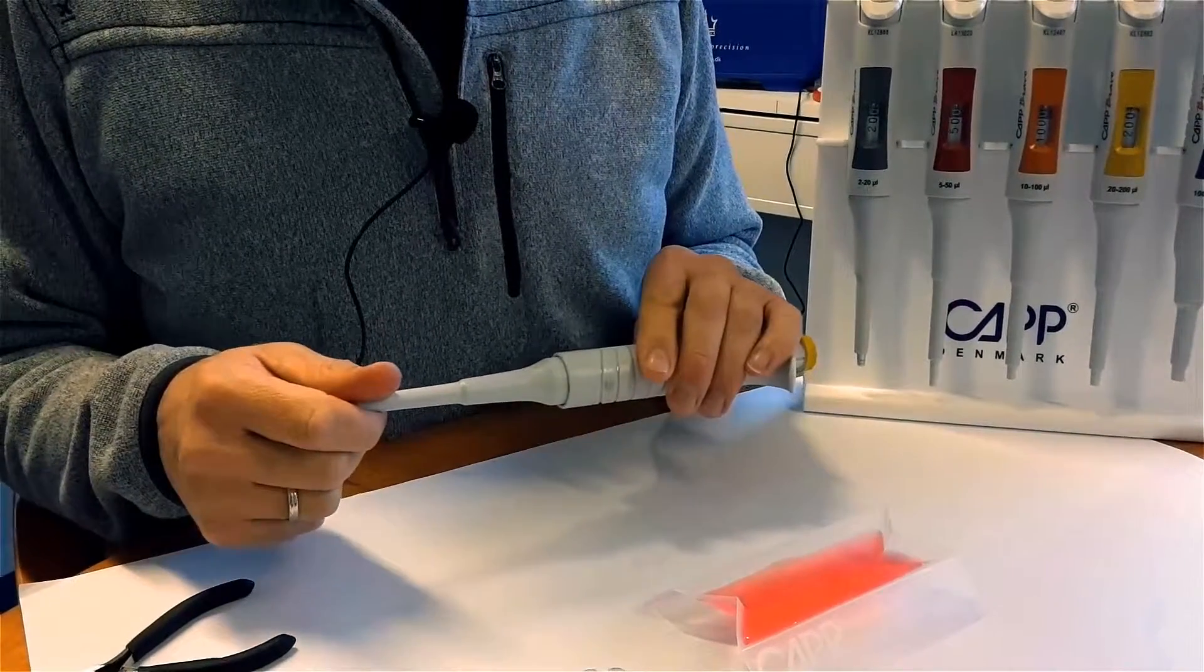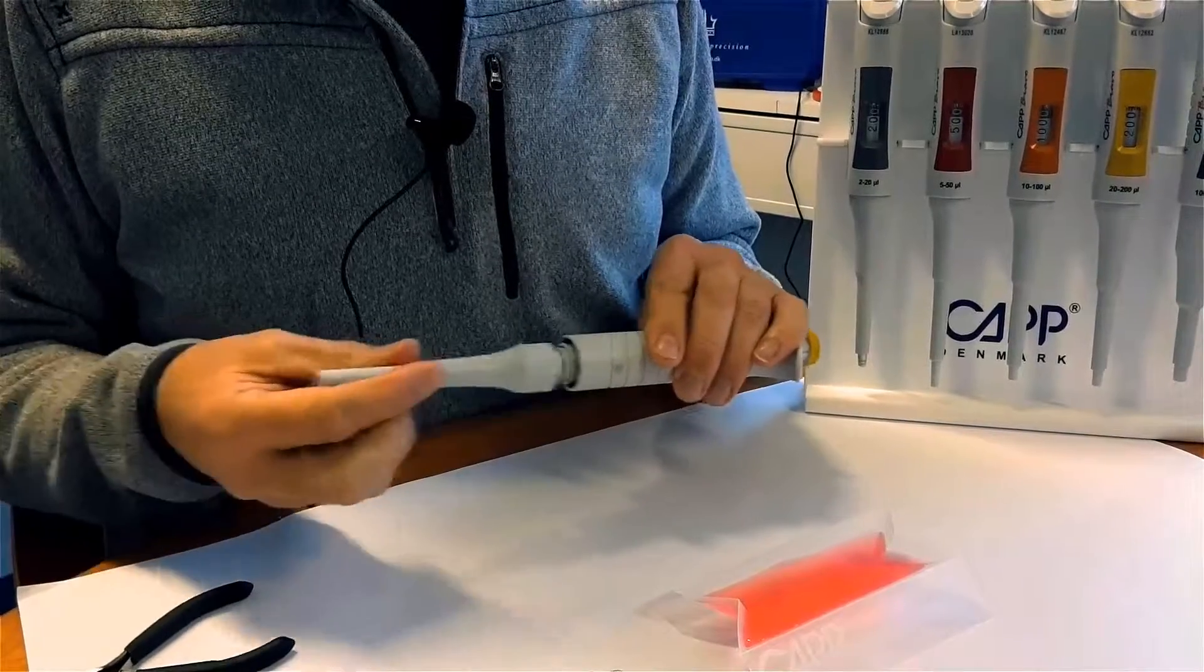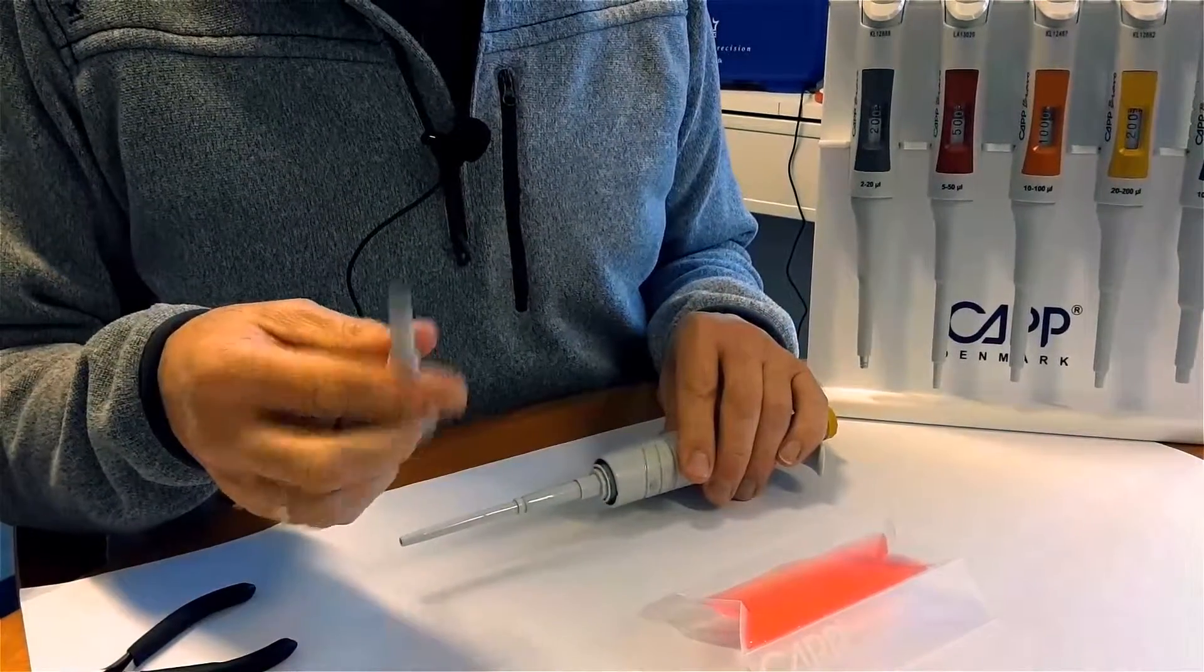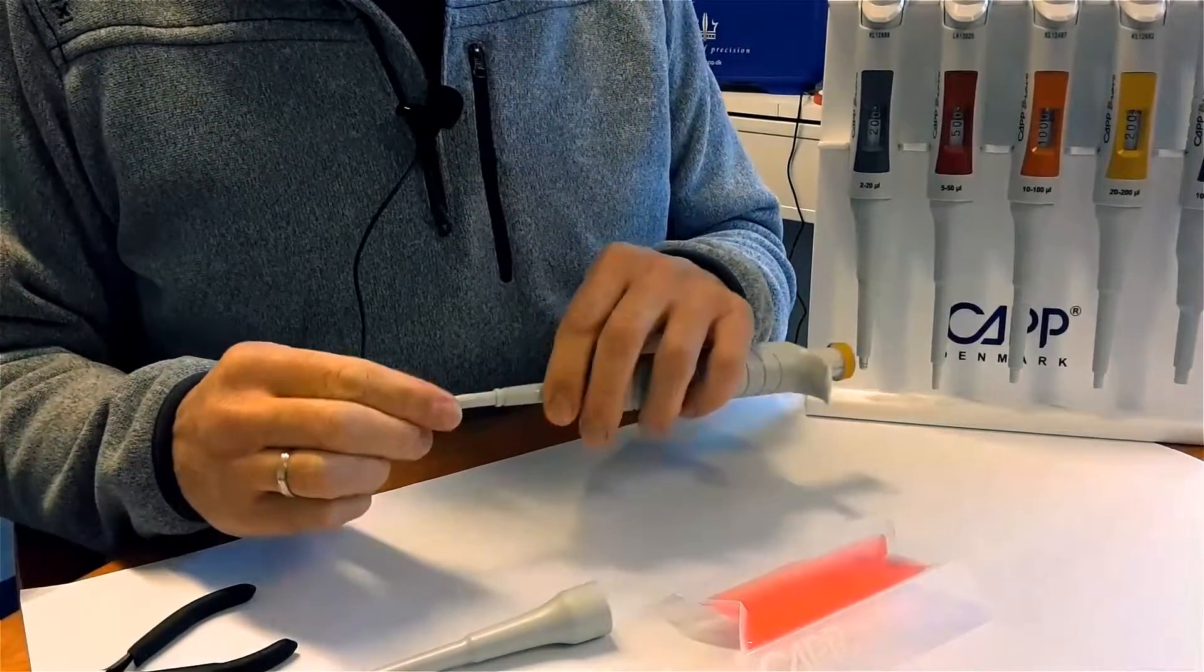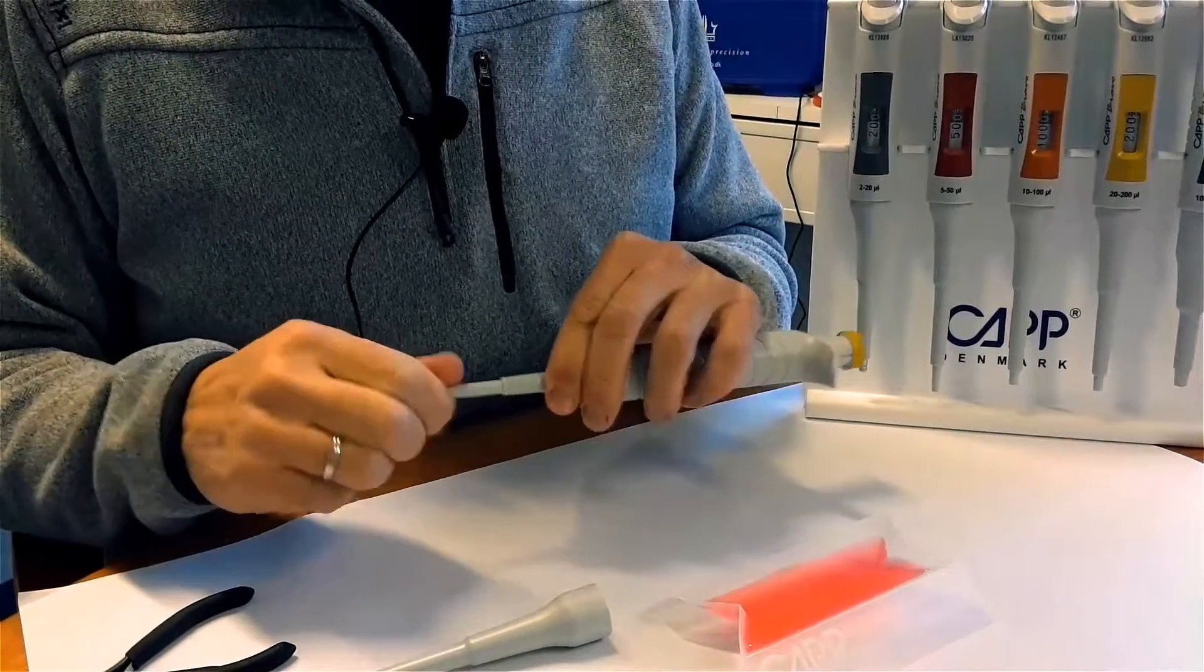Take the tip ejector off the pipette by gently unscrewing it. Check for visual signs of contamination. Verify that the tip cone lower part is firmly connected to the upper part and test for leakage once again.